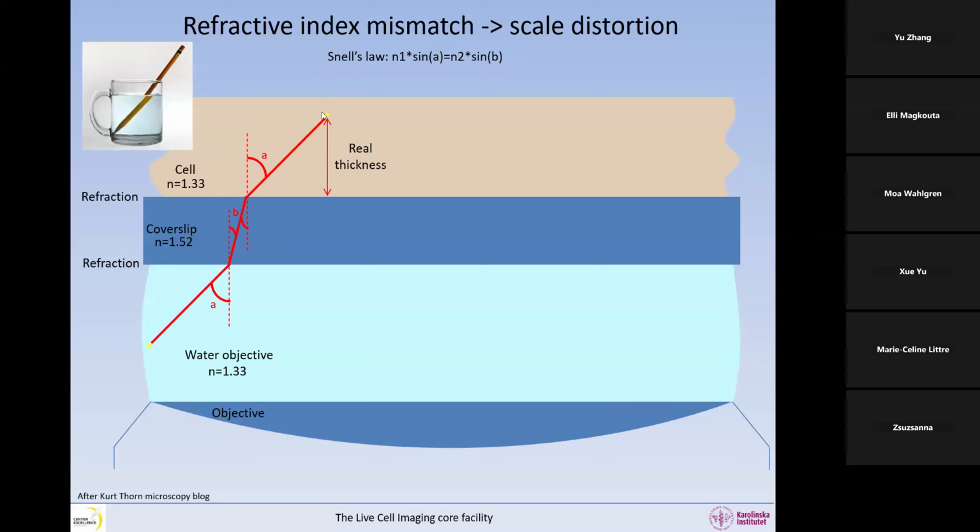So that is a certain distance between the cover slip and this object, which allows you to measure distances in Z. And here we're going to have the same distance that will be measured because the image is formed with the same angle. So fine, there we have the correct data when it comes to measuring distances in Z and therefore volumes, if you are after volumes.